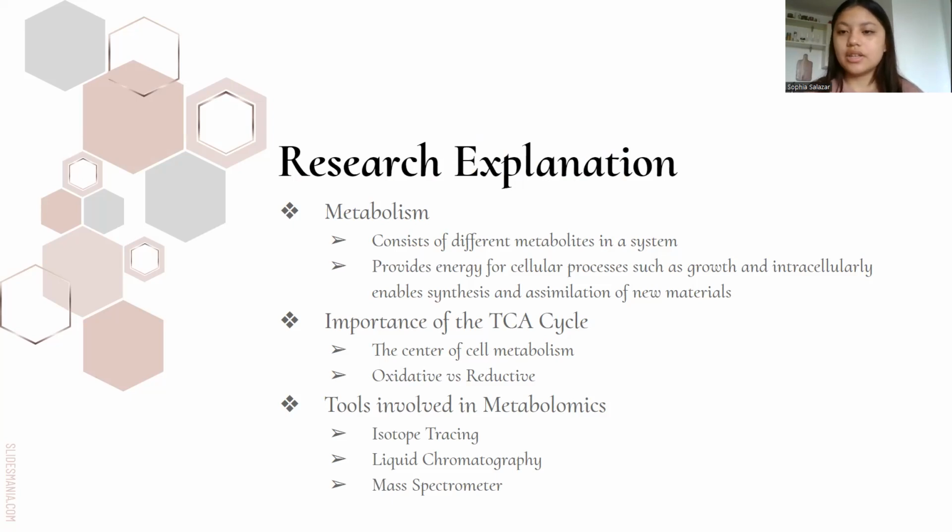To examine the study of metabolism, there are certain tools used. In my research, I use isotope tracing, liquid chromatography, and a mass spectrometer. Isotope tracing consists of unveiling which metabolic pathways are active and inactive, and it also enables an understanding of a metabolic pathway's flux. Flux is the ability of one metabolite to convert to another, which means that when a metabolite has a higher flux, it has a higher and faster labeling rate.